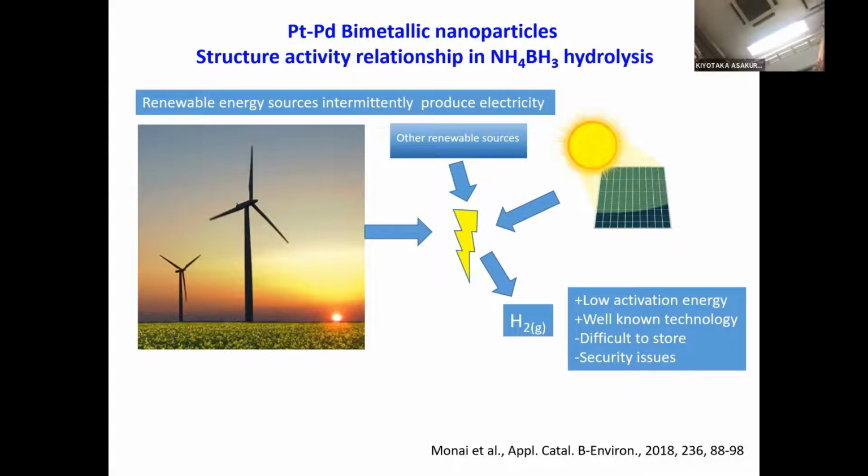Sorry. So I think that you first adjust the curvature. I mean that it is very difficult to obtain the correct coverage. So did you monitor the spot size, or first you scan the monochromator for a region and you find good coverage every place and you make some database, then you operate it for the user beam time or something?